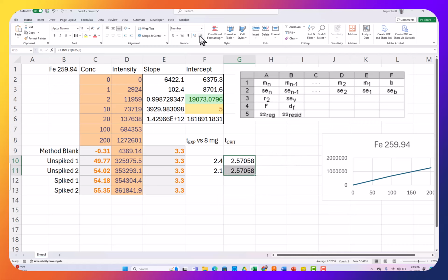And these, 2.6. So is the difference significant? This is insignificant, as is this. Because 5 plus or minus 3 is within error of 8.